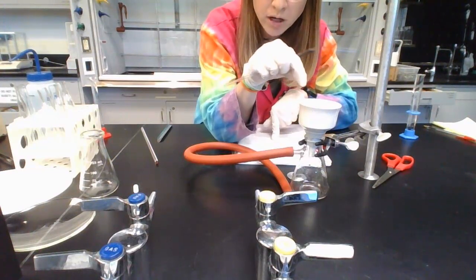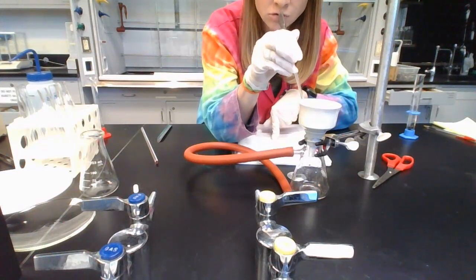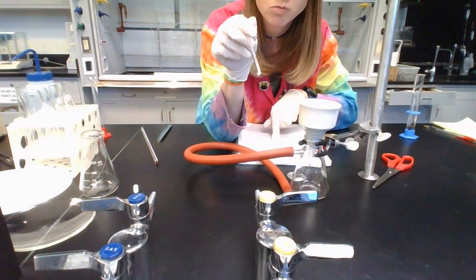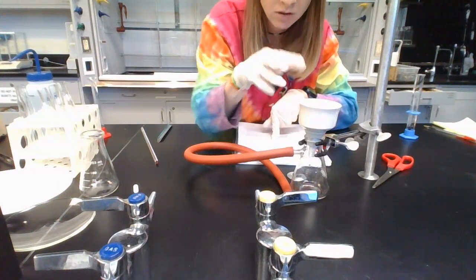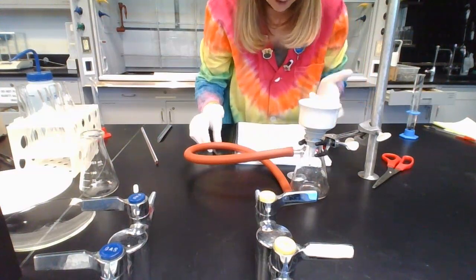So we poured the water in. It's not vacuuming. It's not filtering right now. And then we're just using our glass stir rod to mix it up to make sure the water touches the outside of the crystals. What you don't want to do is be real aggressive about this, because remember there's a piece of filter paper at the bottom, and if you rip your filter paper, then all the aspirin goes down, and that's sad. Okay. So you're going to do that.